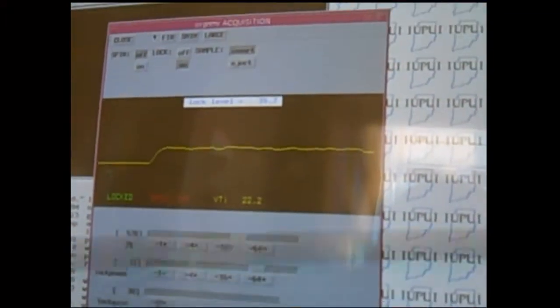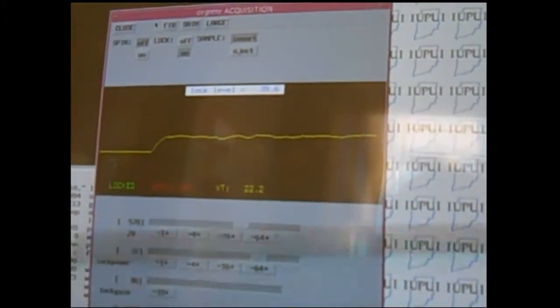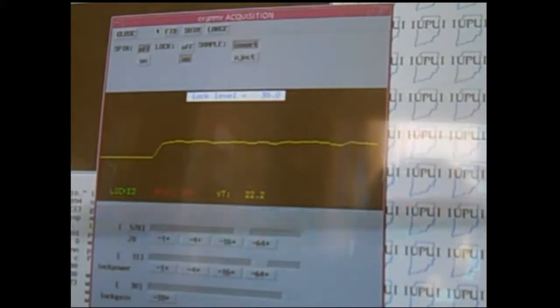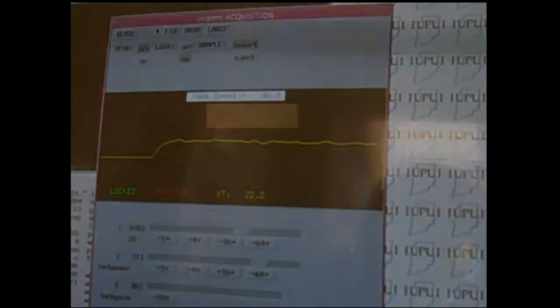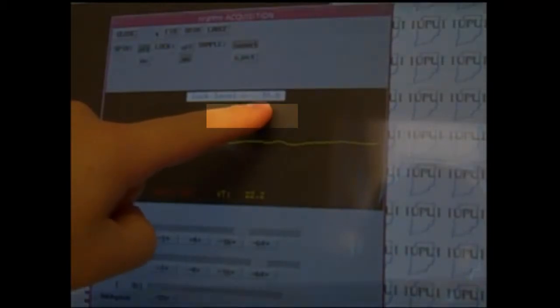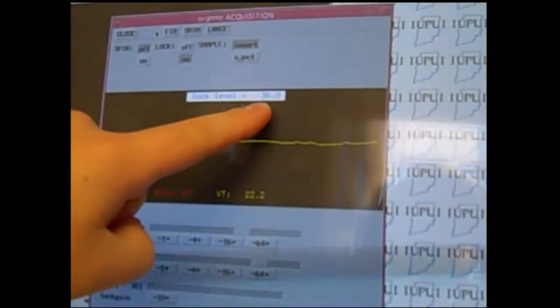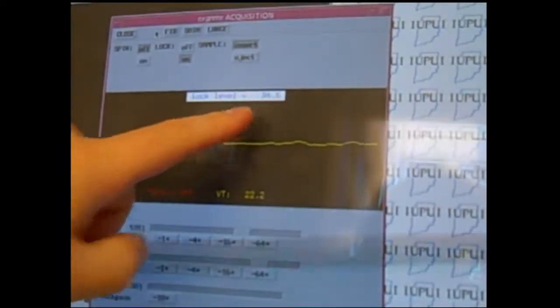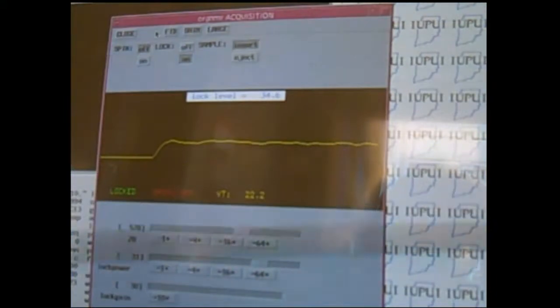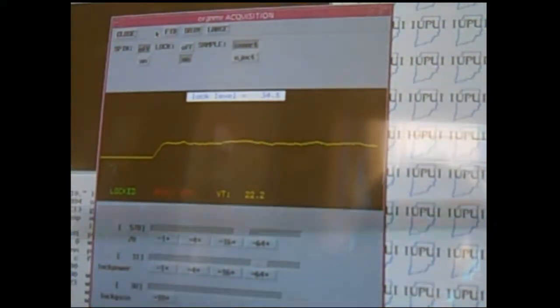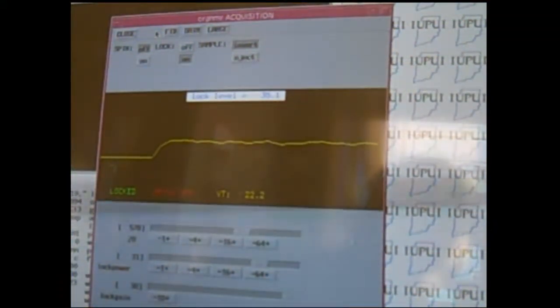At this point, we need to lock on the solvent that we preloaded. We set this solvent as chloroform. Right now we need to maximize that lock on the signal coming from chloroform. If we go over here to the lock menu, this will open up a whole toolkit of ways to maximize this lock signal. Currently the lock level, which is red right here, is at 35. Ideally we'd like that lock level to be around 50, and we want everything to be locked and shimmed as closely as possible to the ideal.